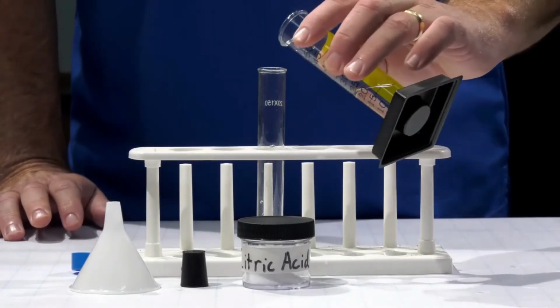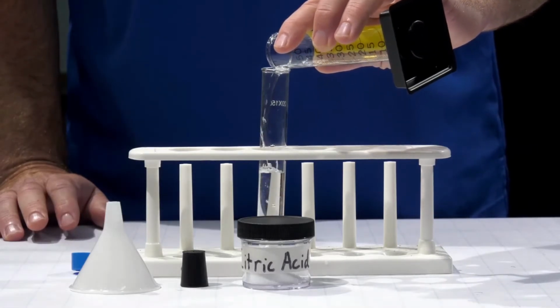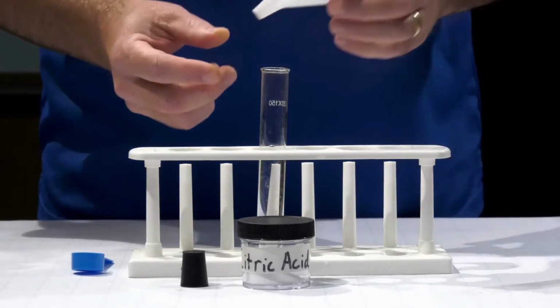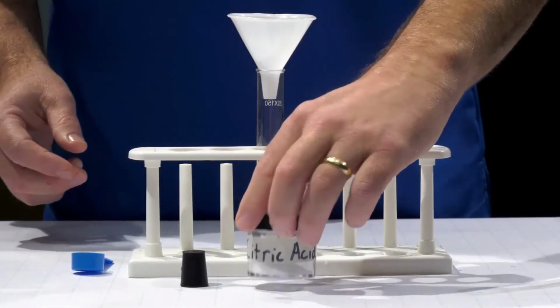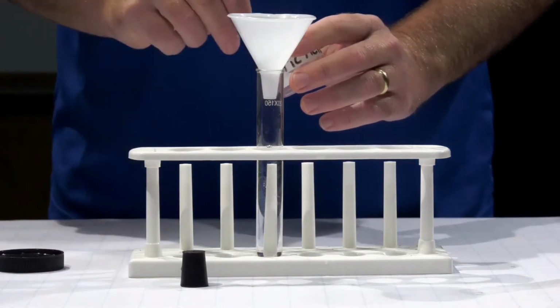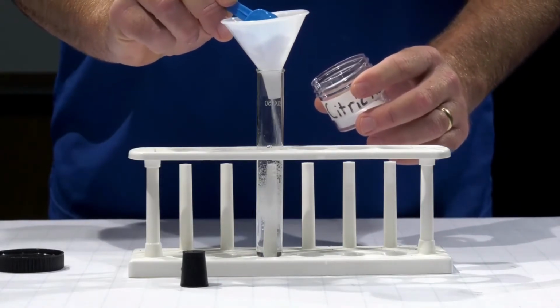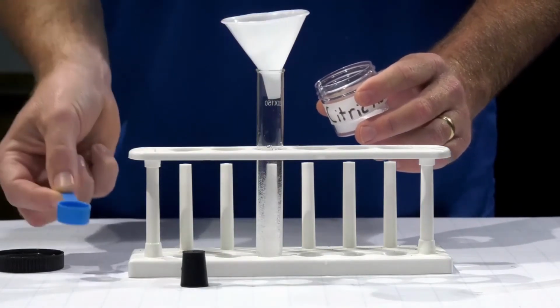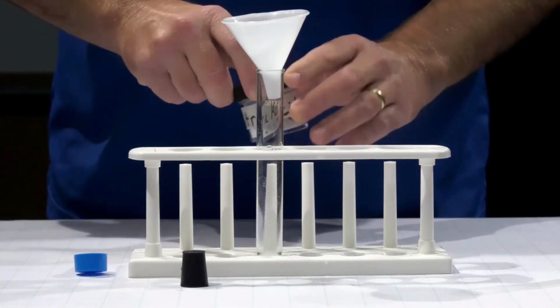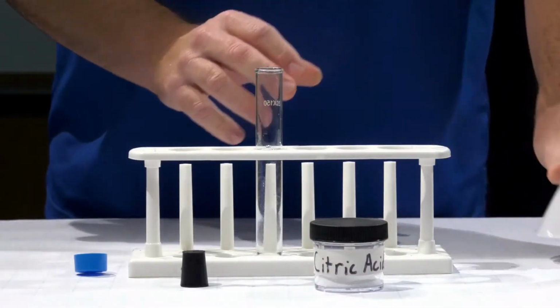Then we have citric acid, same amount of water. Same amount in the scoop again, because those have to be exactly the same in order to be able to compare them. So the amount of water and the amount in the scoop are controlled variables.